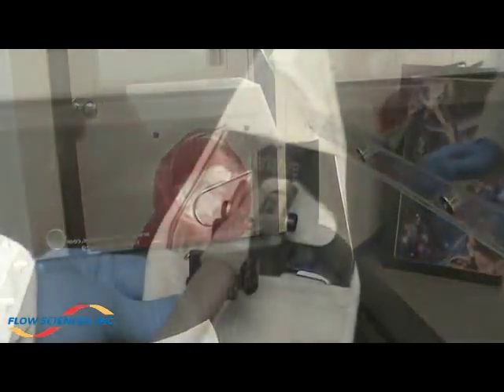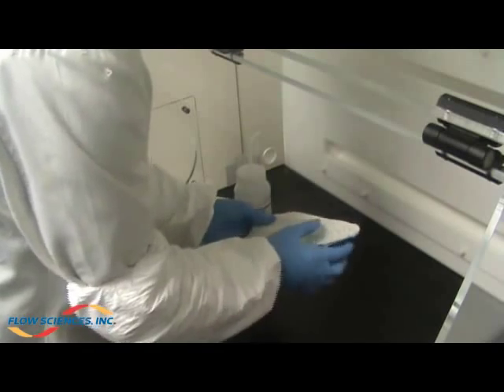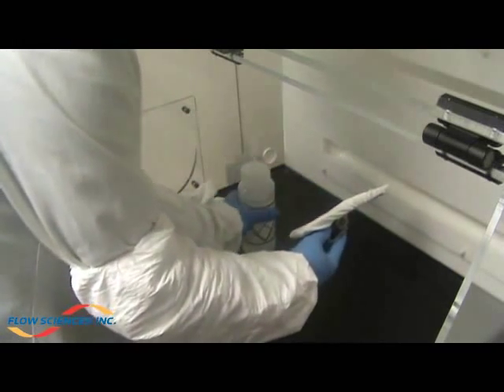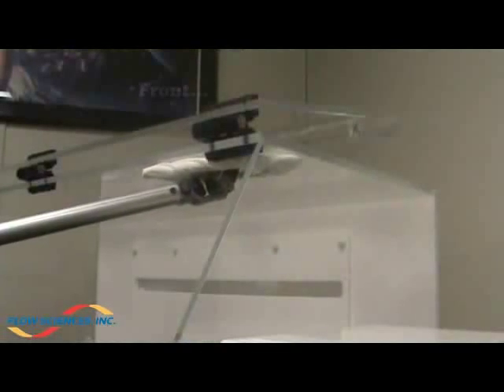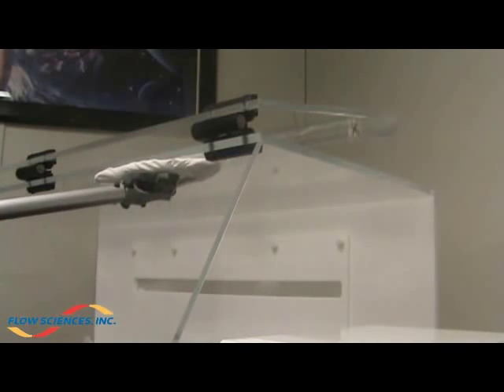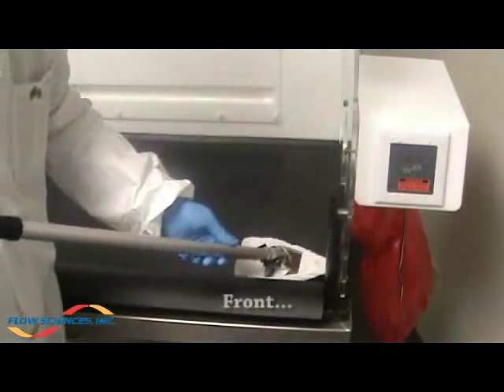The Flow Sciences cleaning protocol can also be accomplished with the Berkshire EasyClean tool to minimize worker exposure. Start by placing a dry isolator cover on the tool, then saturate the dry cover with an approved wet solution. The tool can be used to clean the top of the enclosure, the rear plenum, the side walls, and the bottom phenolic base.